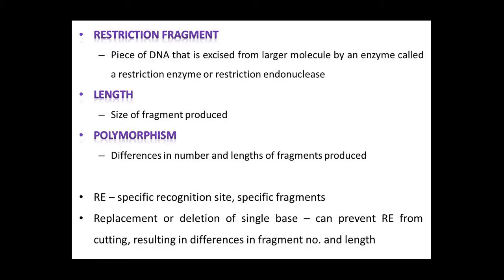If two organisms differ in the distance between sites of cleavage of a particular restriction endonuclease, the length of the DNA fragments produced upon digestion will obviously differ. The similarity or dissimilarity of patterns generated can be used to differentiate species and even strains from one another.